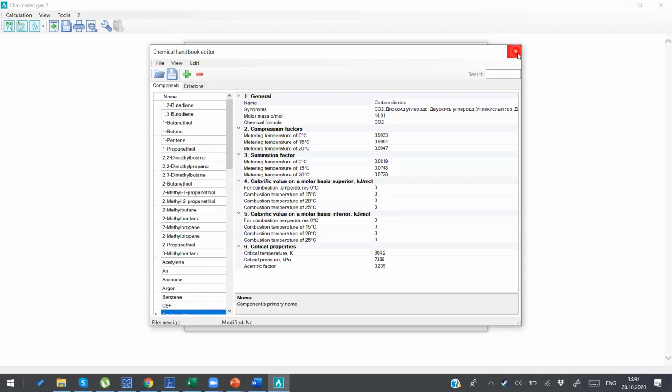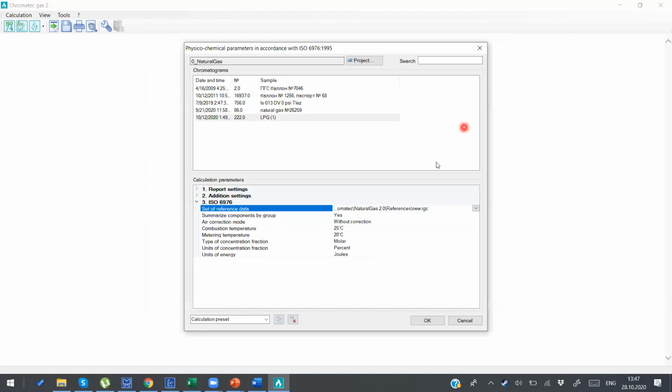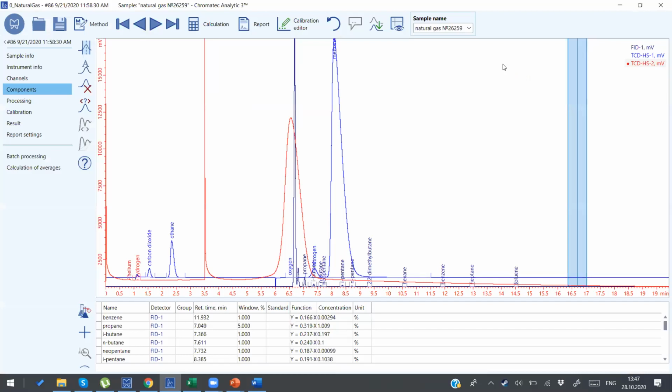Okay, so it was our Chromatec Gas software. Chromatec Gas software is a separate software and it should be ordered separately. Yes, of course, George. Okay, thank you for your question.